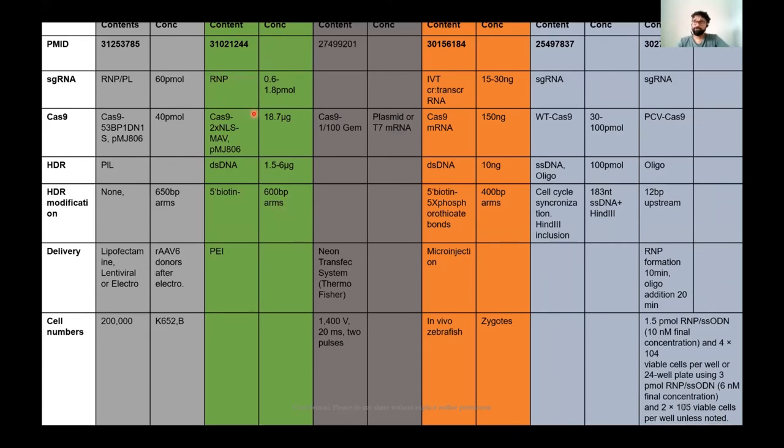With the RNP concentrations, you have to test it out, right? If you're using the plasmid version, with the polycistronic in non-primary cells, use around 1 microgram for a million cells. But for primary cells in the RNP version, I would always start with a lower concentration of RNP and do a test gradient, right? Lower is actually better in most cases because it does not induce a huge toxic effect in your cells, the cells largely do not die, and the efficiency actually increases.